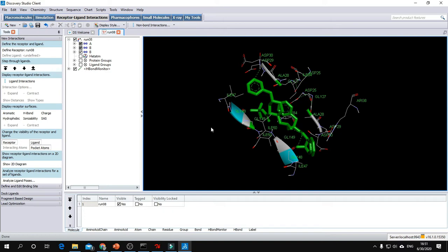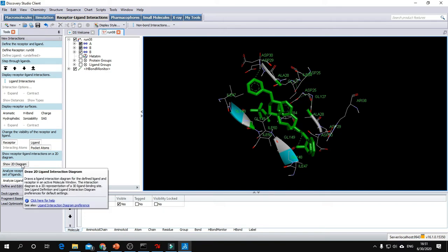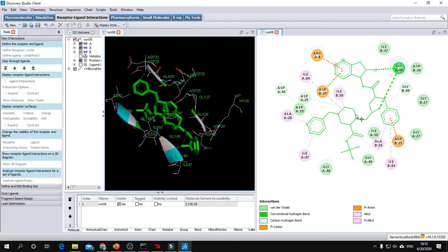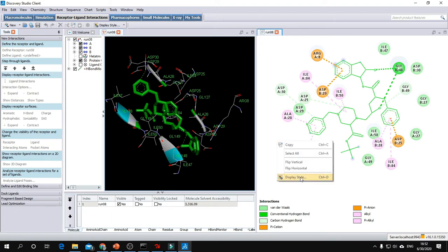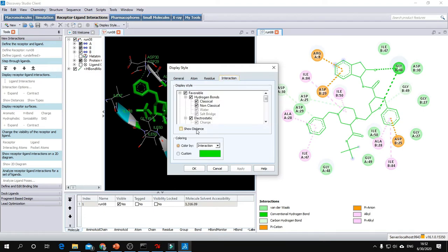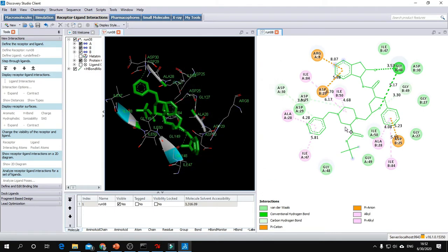To visualize the 2D diagram of these interactions, go to Show 2D Diagram. Here you can see two conventional hydrogen bonds, pi-cation and pi-anion interactions. The rest are pi-alkyl bonds and carbon-hydrogen bonds. You can show the distance of each bond by right-clicking on the white space, Display Style, Interactions, Show Distance. It will display the distance in angstroms.